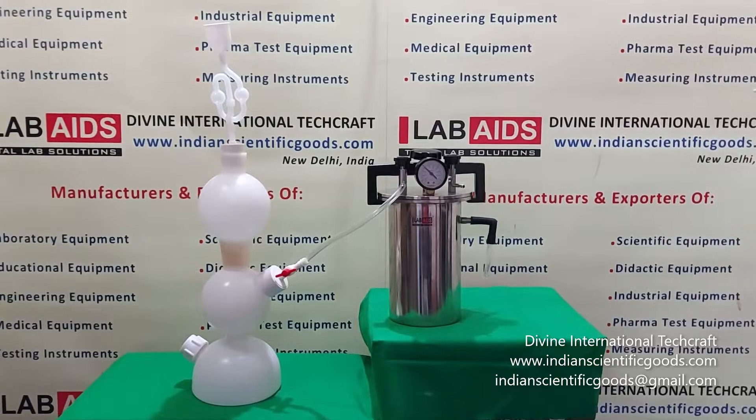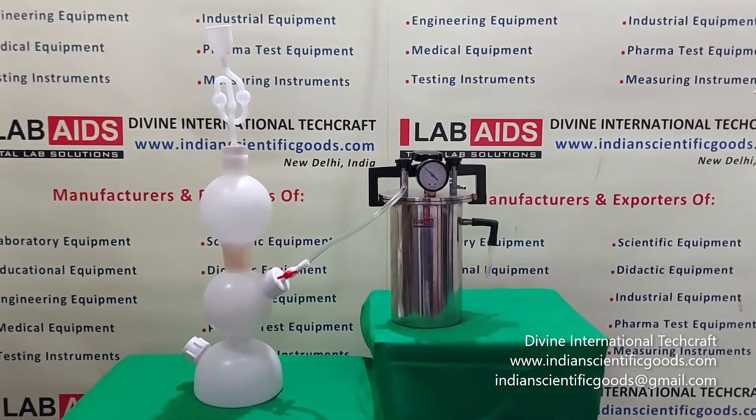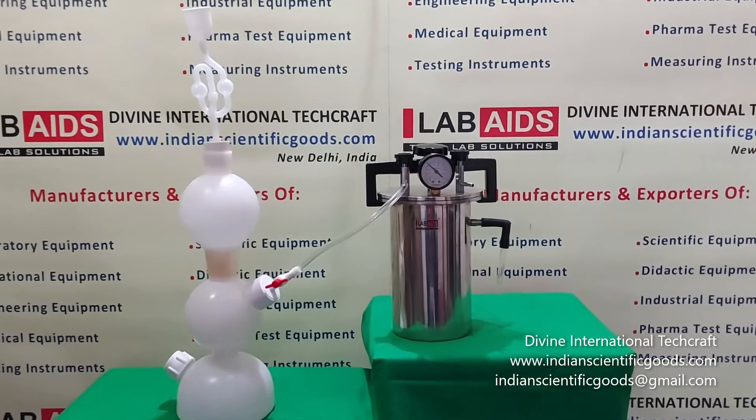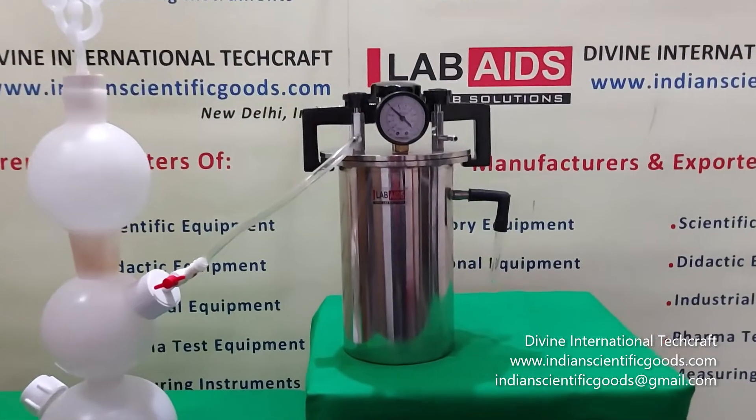Hello, this is an anaerobic culture jar manufactured by Divine International Techcraft, New Delhi, India. This is a BTL type stainless steel anaerobic culture jar.